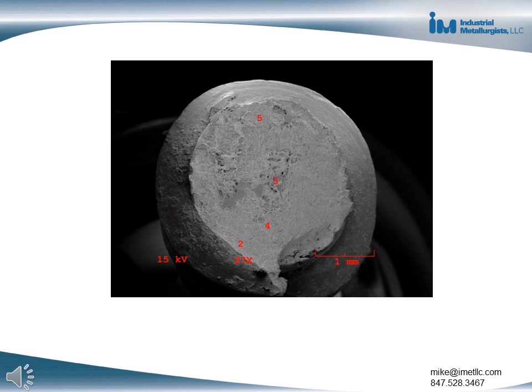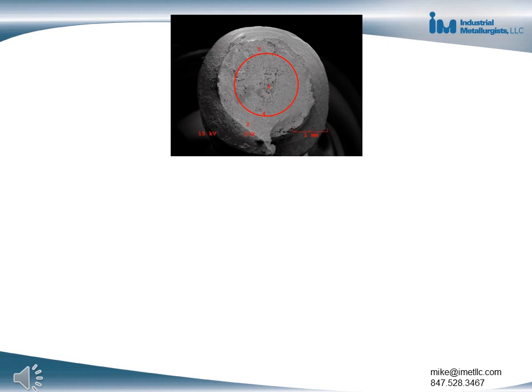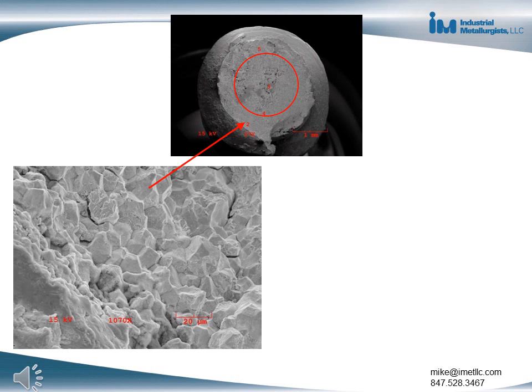This is a low magnification scanning electron microscope image of the fracture surface. Two different types of fracture features were seen. Along the outer portion of the fracture surface, there was intergranular cracking, which means the crack grew along the grain boundaries — which is not desired.